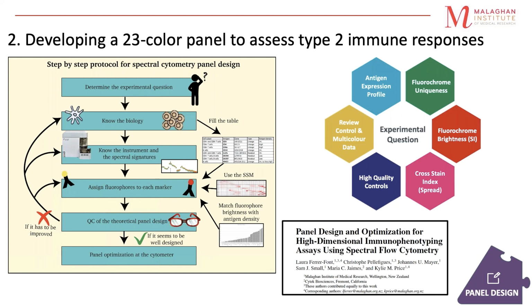In our case, for our panel optimization, we had to run 11 experiments before we were satisfied with our panel. Today, I won't guide you through these 11 experiments, so I'll only show you some tricks or things that we learned along the way that can be useful when optimizing a high-dimensional immunophenotyping panel.